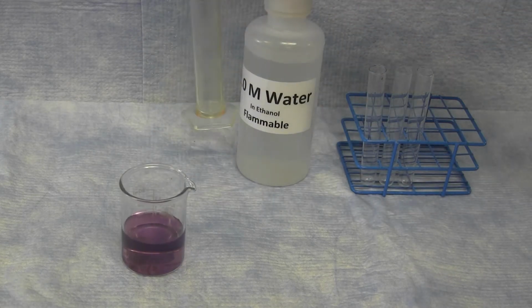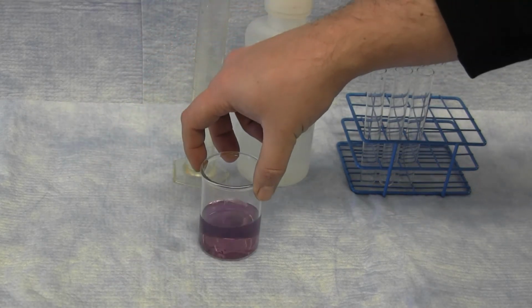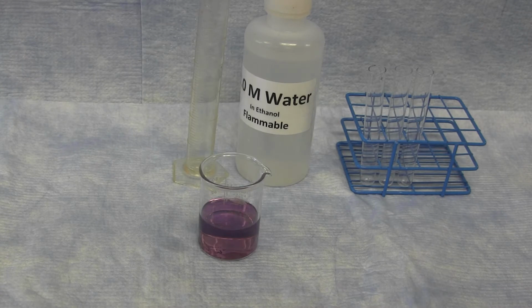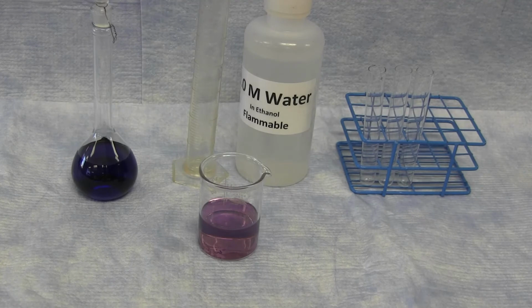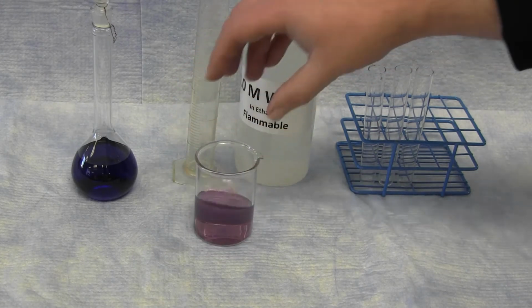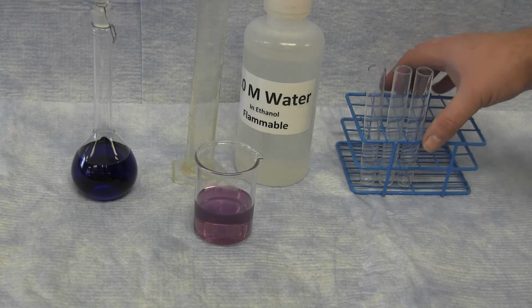You will notice now that this solution is more of a purple color. This is a combination of the equilibrium products: the blue cobalt tetrachloride complex, which is found in ethanol, and the red cobalt hexaaquo complex, which is found in water. This purple solution is a combination of both of those two different complexes existing in equilibrium.